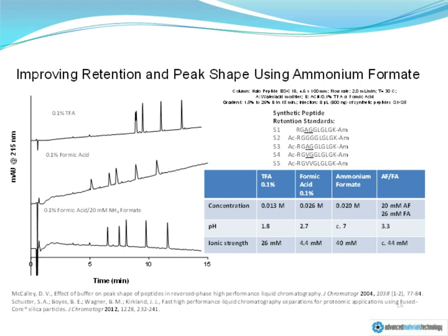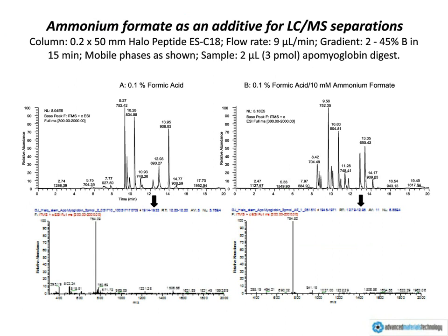And we also took the analysis a little bit further. By the way, the reason why we thought that this would be an okay idea was that we knew from many years of work on small molecule LC-MS applications that ammonium formate is not terribly problematic with respect to online mass spectral detection. So we did all of this work with online detection, in this case with an ion trap as the mass spectral detector, and detailed not only the characteristics with respect to separation properties, but also the mass spectral detection properties.